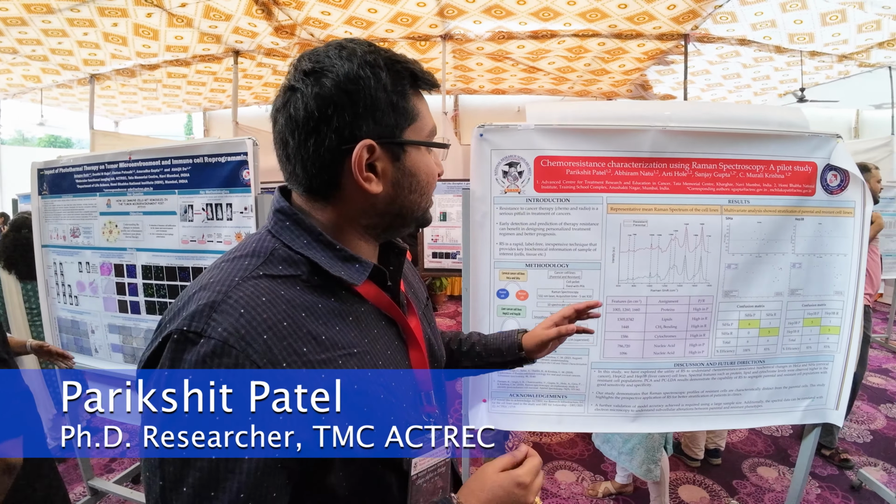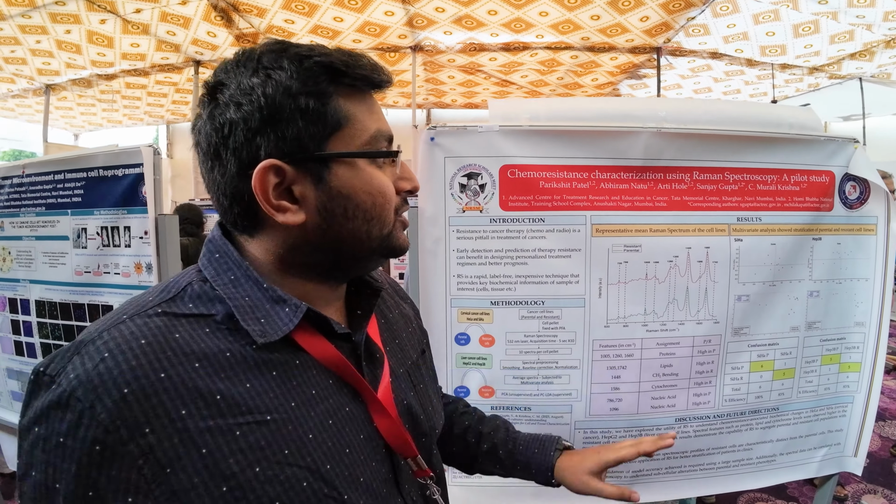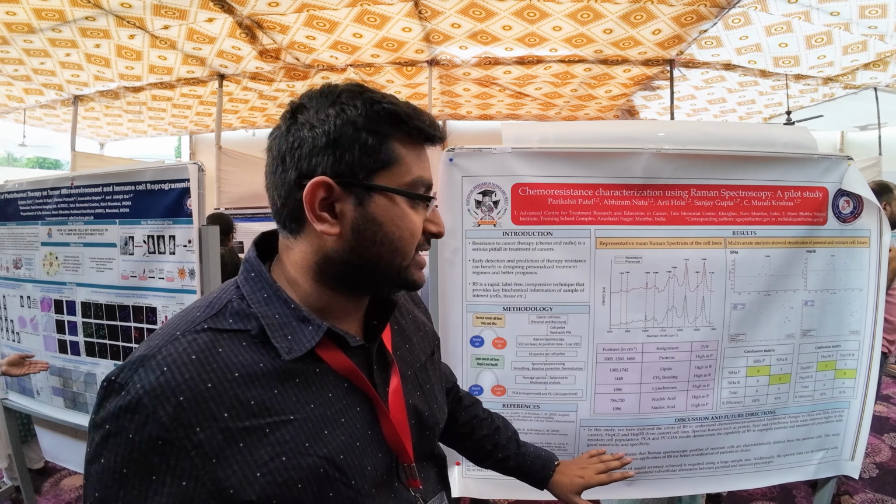Okay, so the title of the poster is Chemoresistance Characterization using Raman Spectroscopy. So this is pilot study data that I am presenting today.